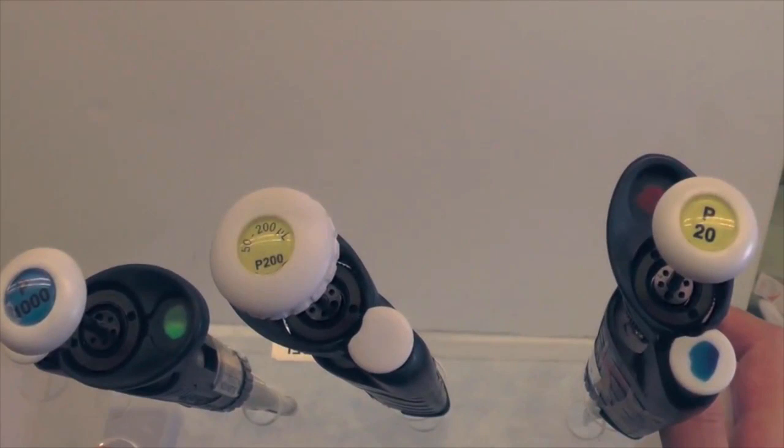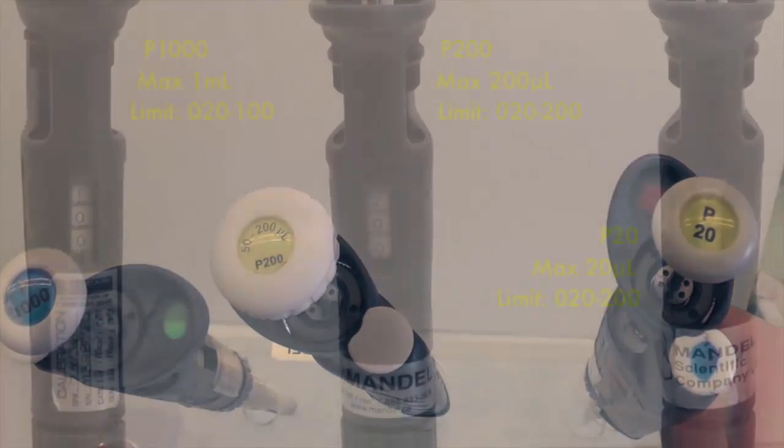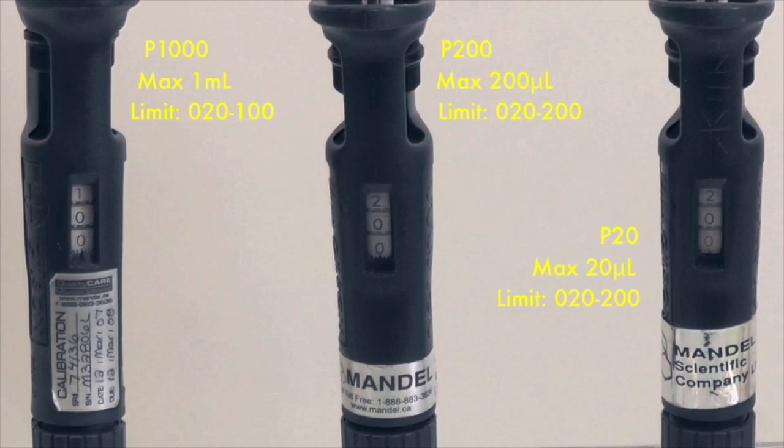The three types of pipetment we will introduce in this video are P1000, P200, and P20. The number denotes the maximum volume transferred by the pipetment in microliters.